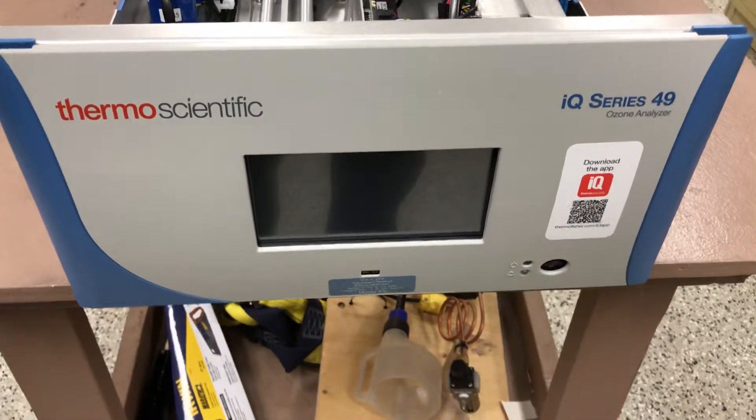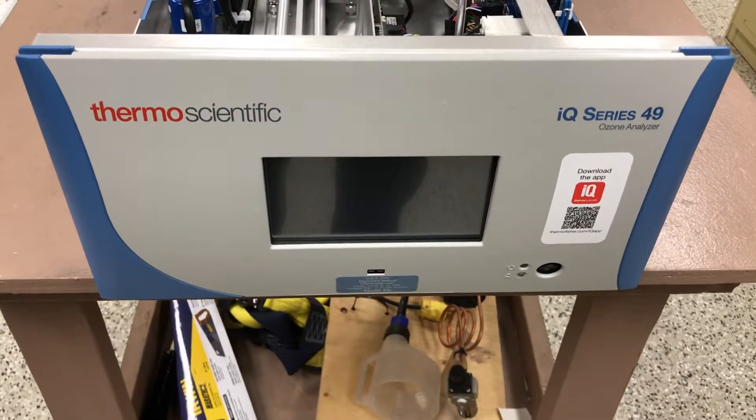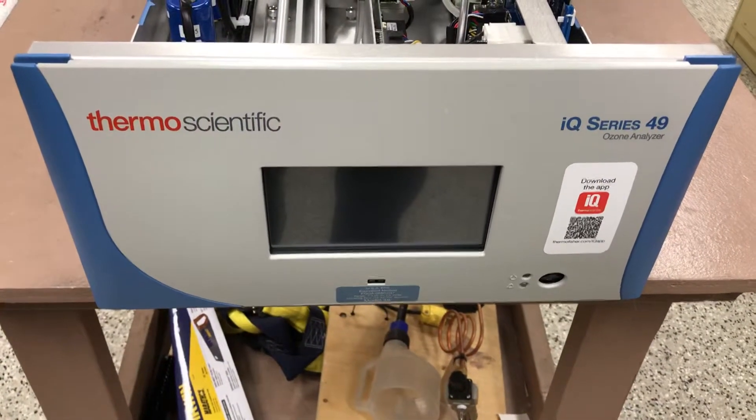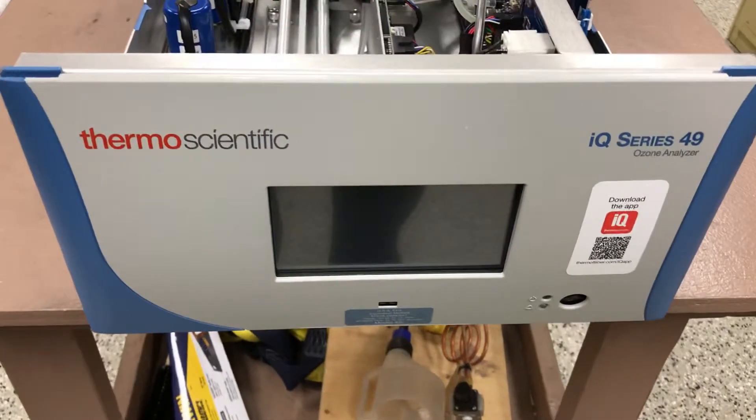Hi everyone, Jim with CDNOVA Instruments again. I'm looking at the Model 49 IQ Ozone Analyzer, the next generation after the Model 49i series ozone instruments as well.